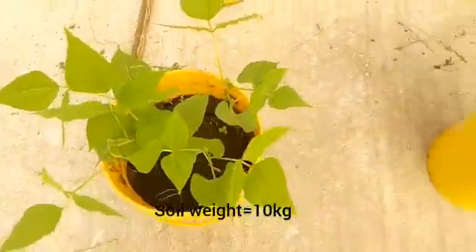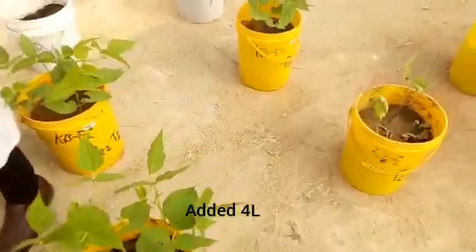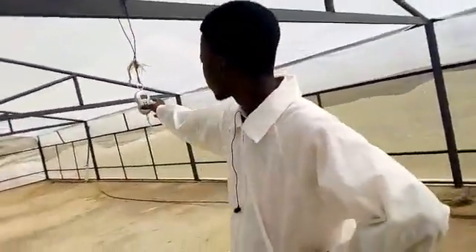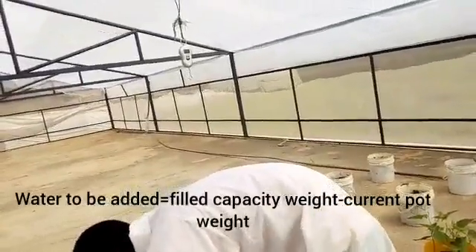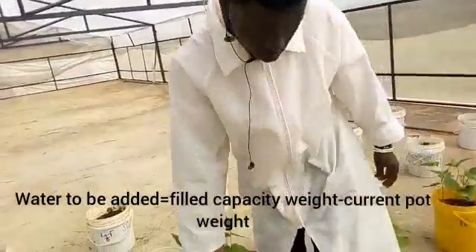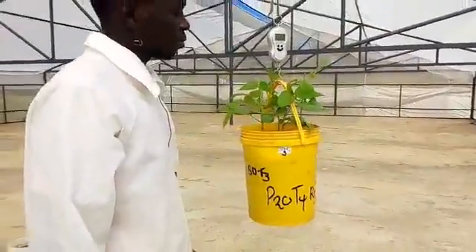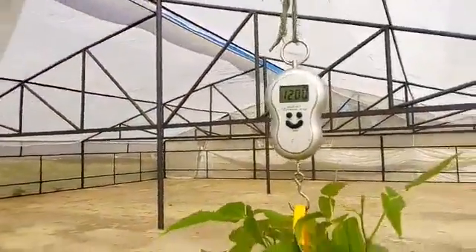So remember, our soils were 10 kgs each, and the amount of water that we had added to fill them to capacity was 4 liters. And so what Mr. Daniel is doing this morning is weighing the pots to see how much they weigh. Daniel, can you lift the pot? So this is treatment 3. That's treatment 4, our Sazu. So we're going to be seeing how much it weighs, and it's going to show us how much water has been lost and how much water needs to be added. So this is how much?